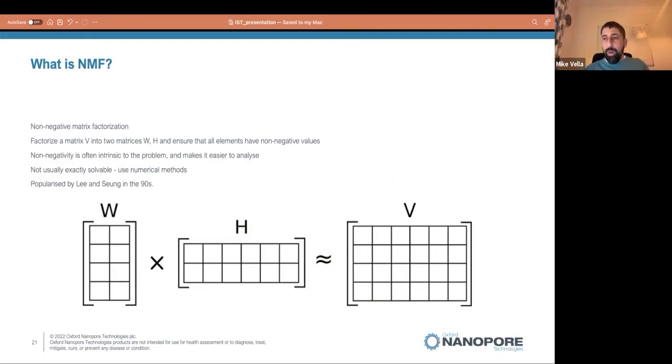So what we do here, for applying this technique to mutational signature analysis, is we take the set of mutations found in DNA samples, and the components are the individual mutational signatures. So we take a sequence of people and what counts of mutations were detected in a tumor, for example. This is a very large matrix because there are many different possible mutation types, and each one will have a count of mutations. And by mapping it down to this latent space, we create what's called mutational signatures.